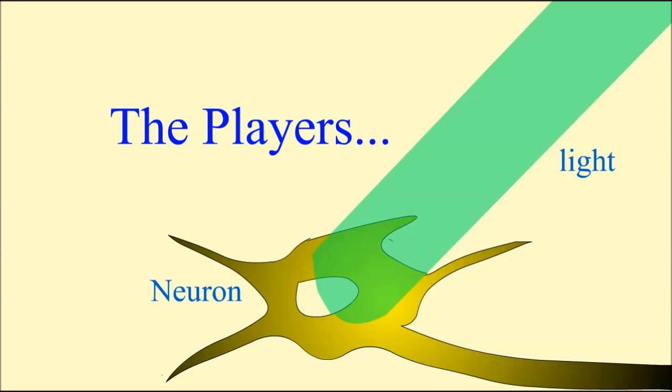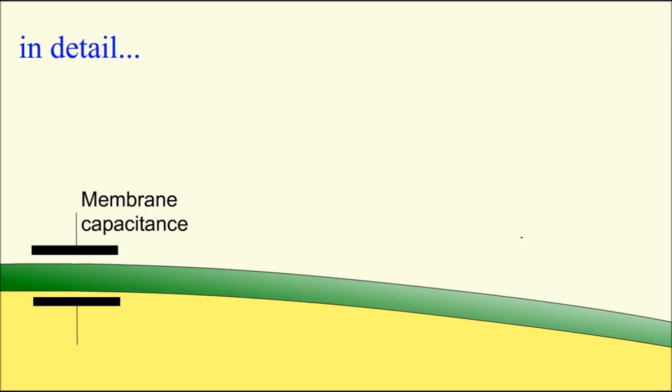Here, we will demonstrate our technique for using gold nanoparticles to optically stimulate specific neurons without needing genetic modification. First, we will review the necessary components for this technique to work. There are several features of the target neuron that play an important role in this method.